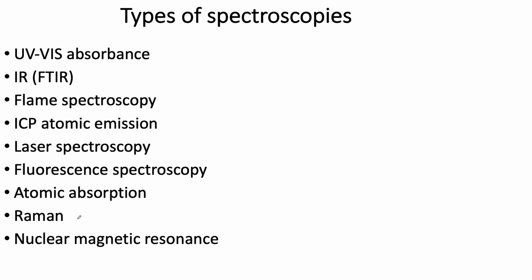But what can happen is that laser light, of course, a laser has a very specific wavelength, unlike the white light that goes through a spectrometer. When you put white light through a spectrometer and it comes out, it's still somewhat broad because it's only as good as the monochromator that made it monochromatic. But lasers can be very monochromatic. So there's really only one wavelength that's coming out of that tool, that laser.